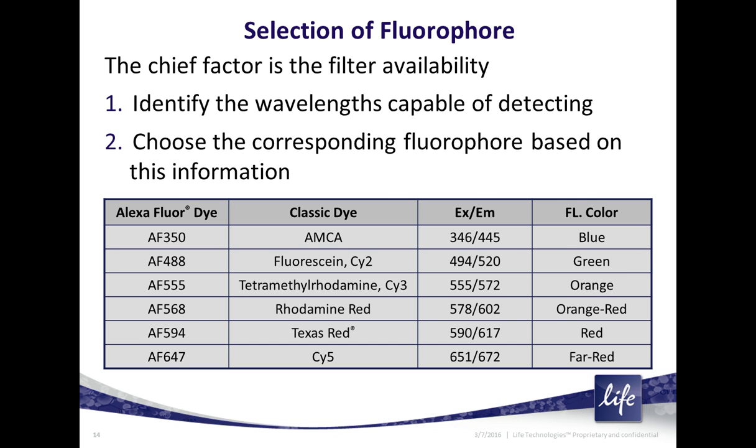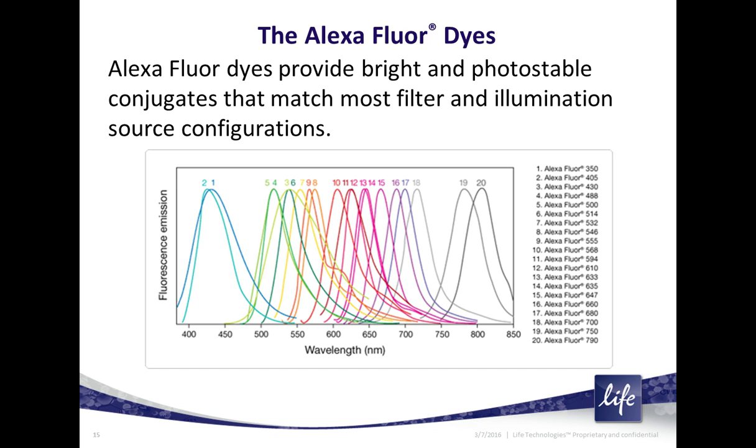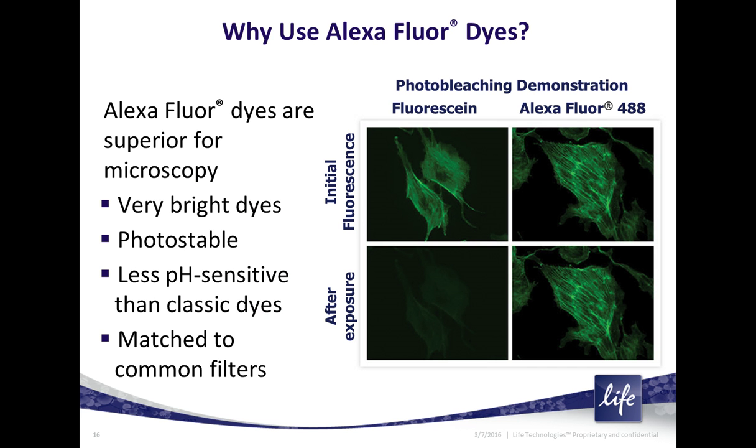Okay. Once you have your secondary antibody, and here you can see in this next slide the various different Alexa Fluor color options that you have. Once you have your secondary antibody, you'll want to have an incubation time.